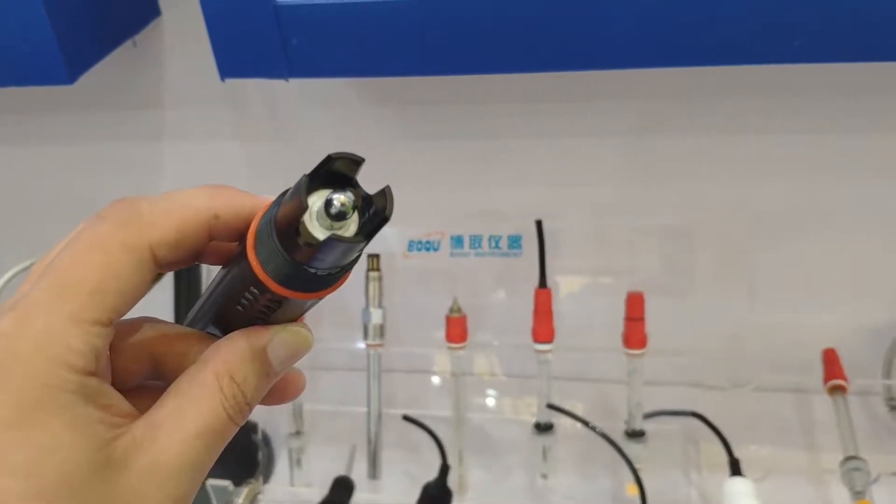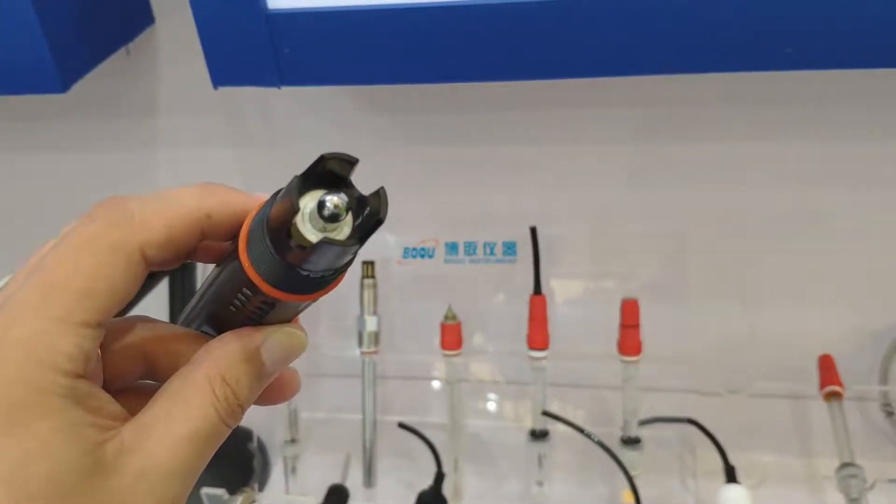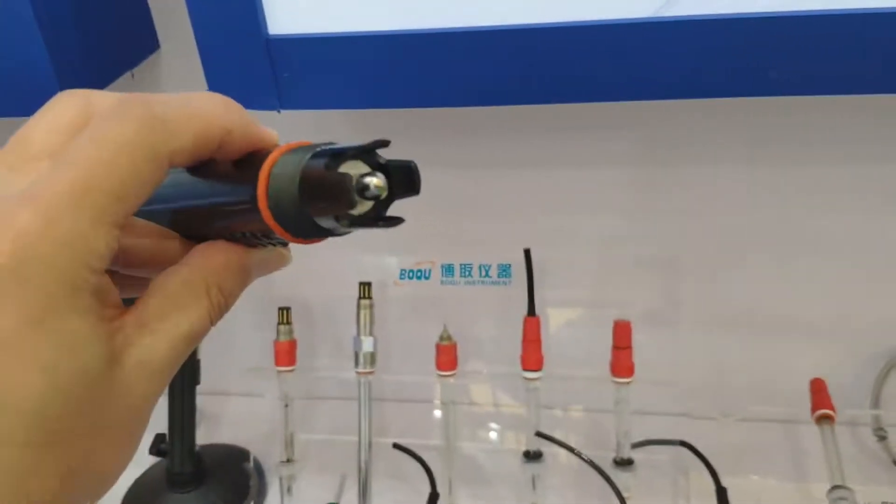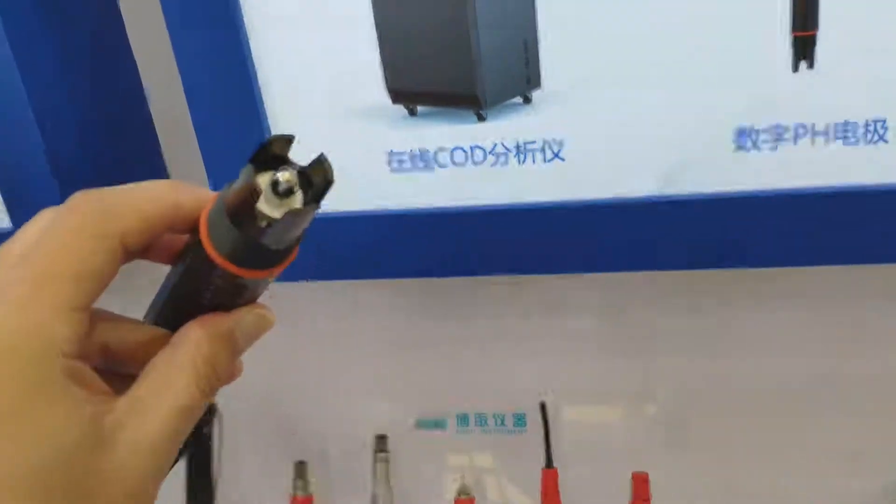HF acid is hydrofluoric acid. This Antimony pH sensor is specially designed for use with HF acid.